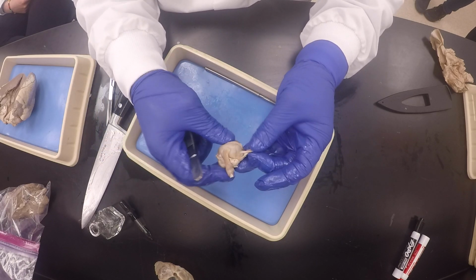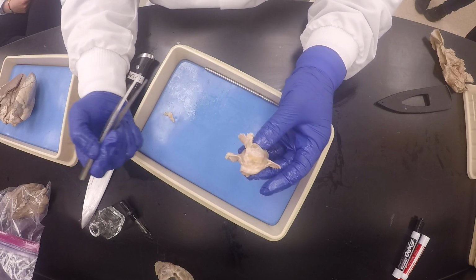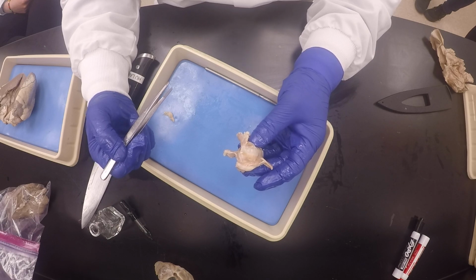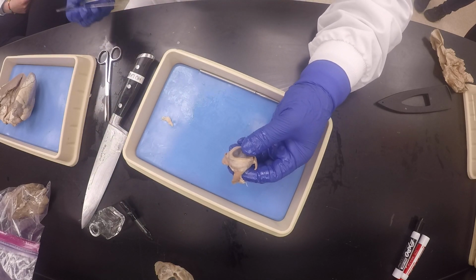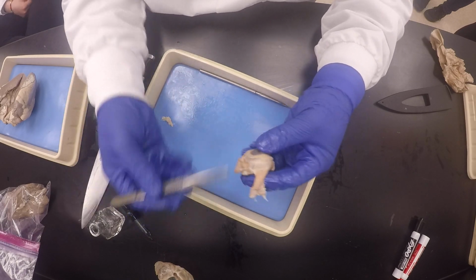Okay? And then obviously since it's a ruminant eye, the retractor bulbi is the seventh. Okay? And the human does not have a retractor bulbi. You understand? Okay, so let's go through the muscles one more time, and then we'll cut everything. Okay, very good.